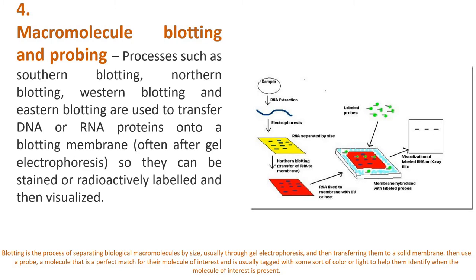والمولكيول حسب البروب اللي موجود اللي هو already known نخليه بالممبرين وندخل هاي المولكيولز different size معهم داخل الممبرين راح نشوف which molecule is identical for that specific probe اللي هو already known. نقدر نقول انه هاي المولكيول هي نفس هذا البروب اللي احنا already we know it وعندنا بيها index يعني.